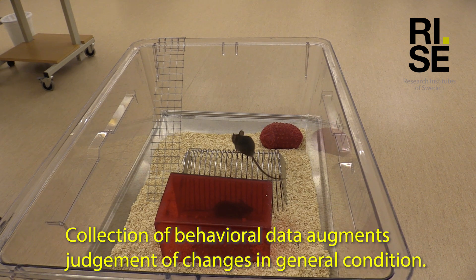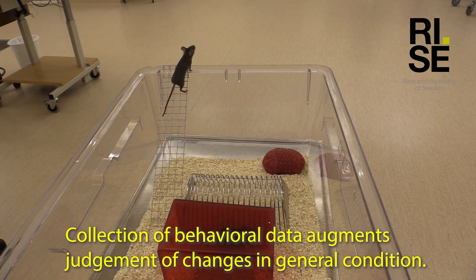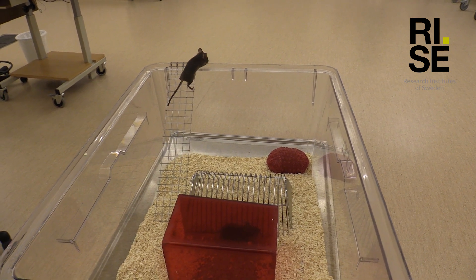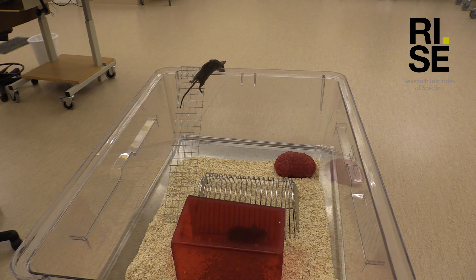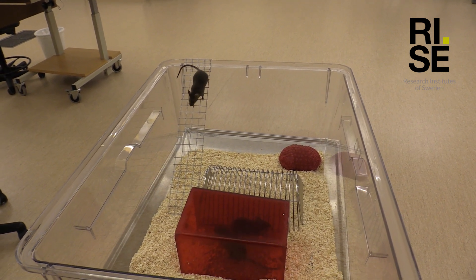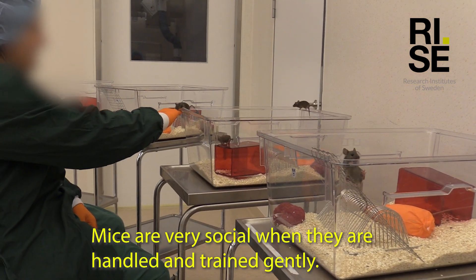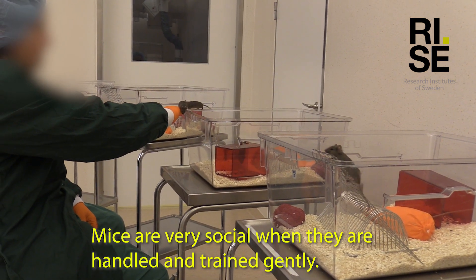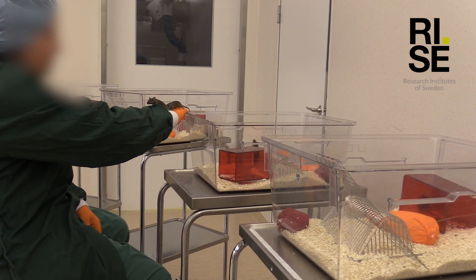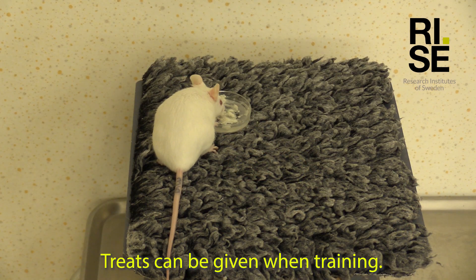Collection of behavioural data augments judgement of changes in general condition. Mice are very social when they are handled and trained gently. Treats can be given when training.